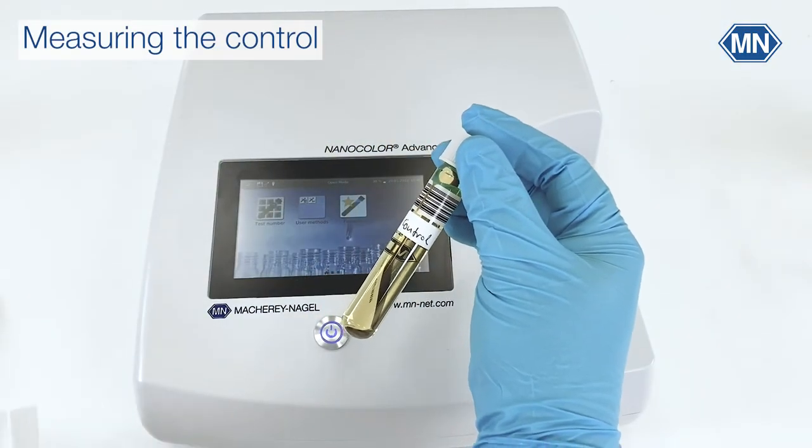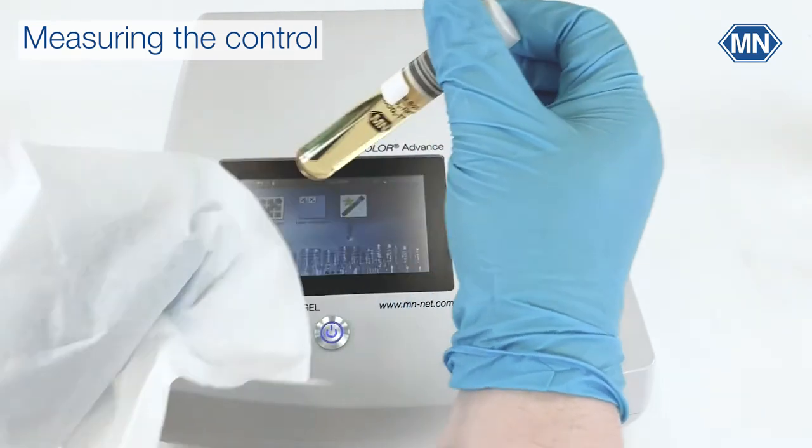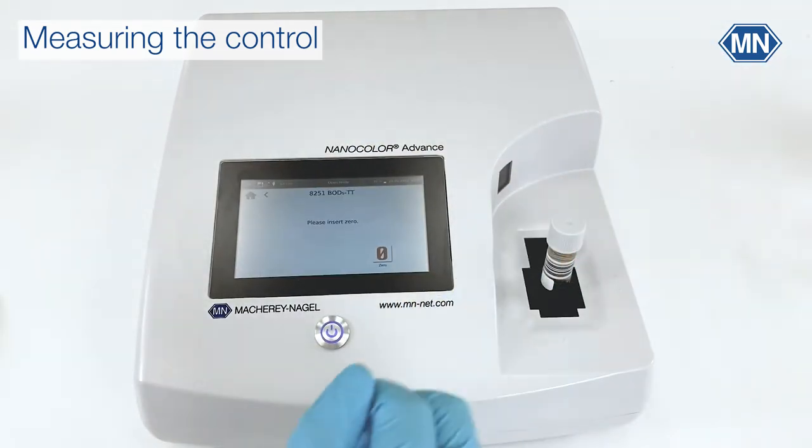Take your control tube and clean it from the outside. Then put it in your photometer and press zero.